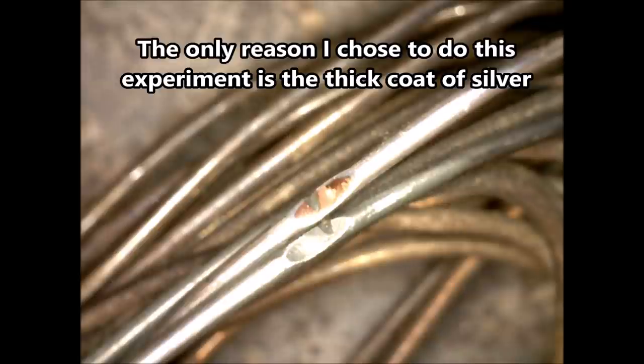Here's a look at the wire under magnification. You can see the copper underneath and the thickness of the silver over the copper. Based on what I'm seeing here, I'm guessing between a five and ten percent yield of pure silver from this silver-plated copper wire.